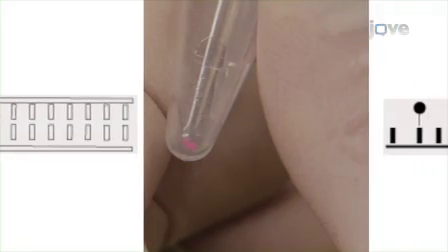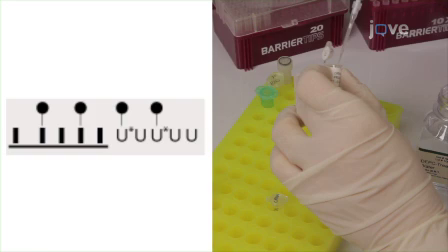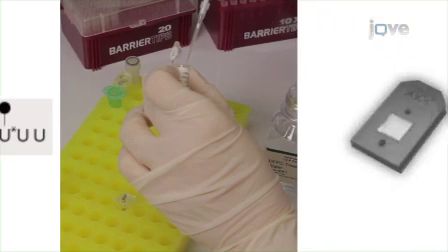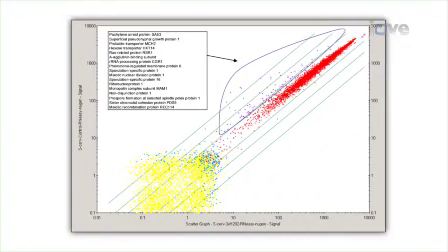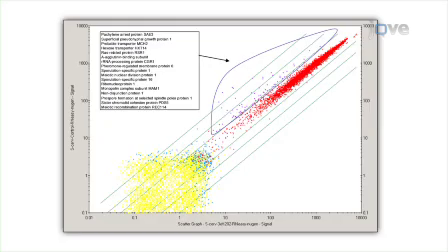The cDNA is then used to prepare biotin-labeled cRNA via in vitro transcription. The final step of the procedure is fragmentation of the biotin-labeled cRNAs for hybridization to the Affymetrix yeast gene chips. Ultimately, results can be obtained that show the expression differences in the two yeast samples, and through bioinformatics demonstrate the power of microarray analysis to undergraduate students.